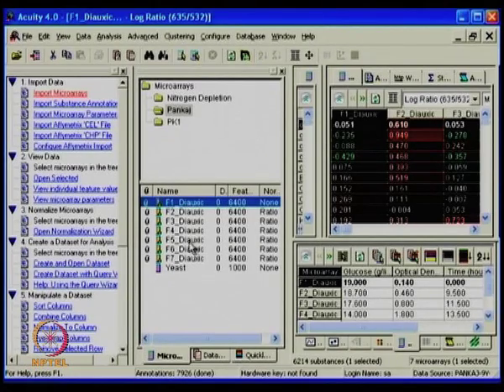Correct. And this is a good point you raised, because a very important next step is substance annotation. The substance here I mean is each spot, which could be the feature, which again could be an RNA or a gene or a protein. That is why we call it substance annotation. Very few people extensively trace them.